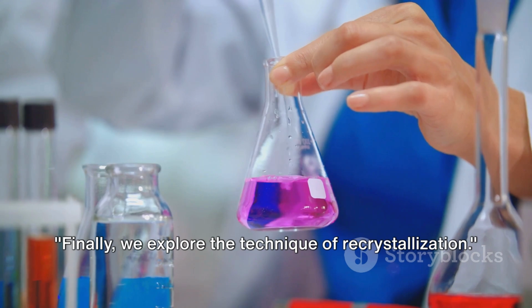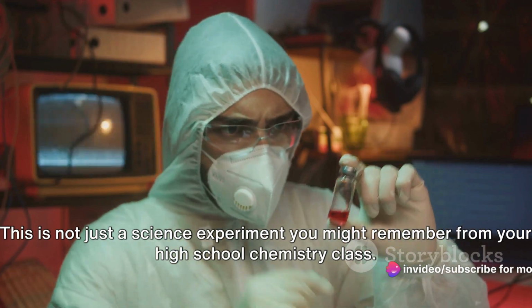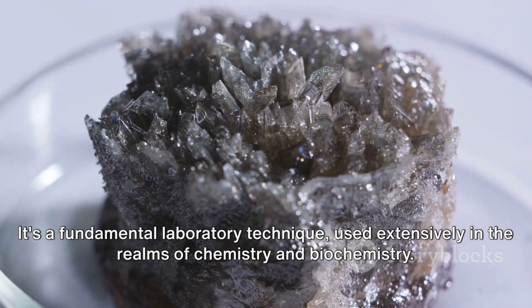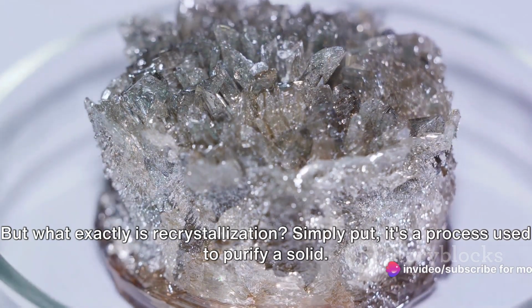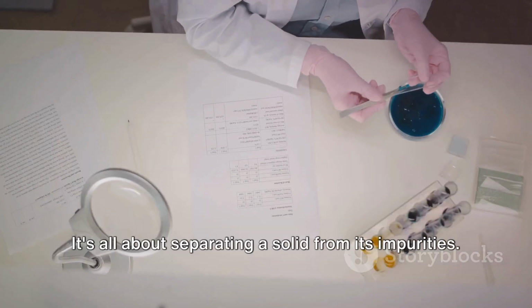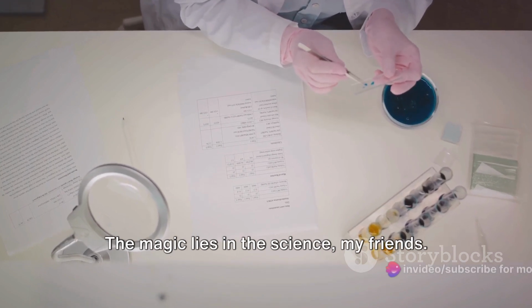Finally, we explore the technique of recrystallization. This is not just a science experiment you might remember from your high school chemistry class. It's a fundamental laboratory technique used extensively in the realms of chemistry and biochemistry. But what exactly is recrystallization? Simply put, it's a process used to purify a solid. It's all about separating a solid from its impurities. This might sound like a magic trick, but it's pure science. The magic lies in the science, my friends.